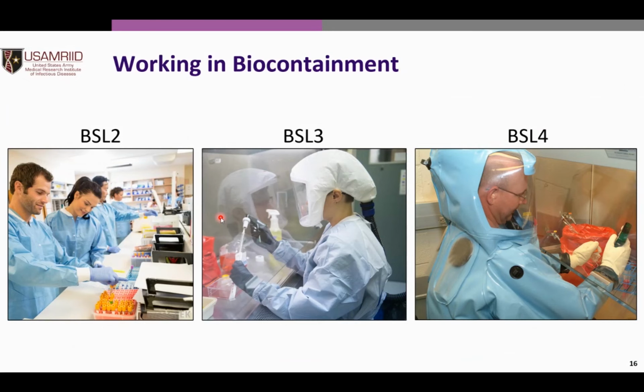This lady in the middle here is working in BSL-3, so she's wearing, at USAMRIID we wear scrubs. Not all institutes with BSL-3 do that. Some people do wear their normal clothing underneath of a Tyvek suit in BSL-3. Anytime you're working with live agent, it has to be in a biosafety cabinet, and you're going to have to be wearing 2 pairs of latex gloves. And she's also wearing a respiratory unit. It's called a PAPR. And just so you guys are aware, for coronavirus, USAMRIID is handling all of our live coronavirus in a BSL-3 environment right now.